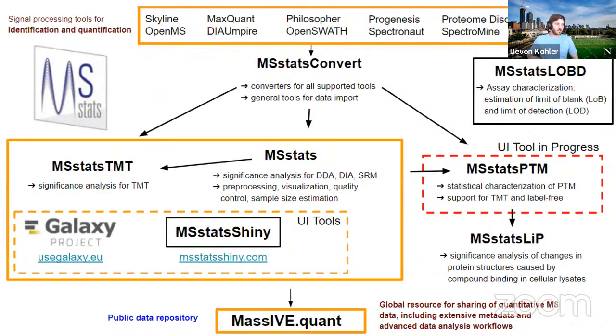Okay, so I think Olga showed this slide a bit yesterday. This is the high overview of all of the different packages and how they work. So I wanted to go through it real quick and just show you what is going on, because it can be a lot.